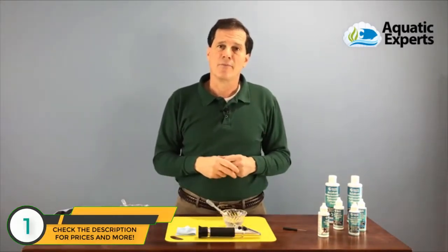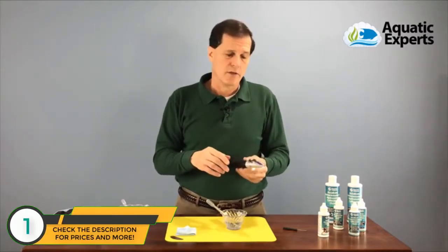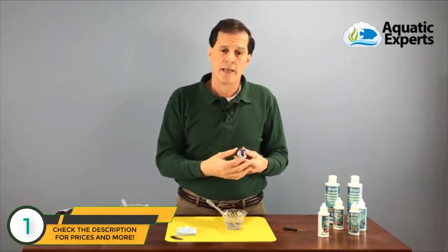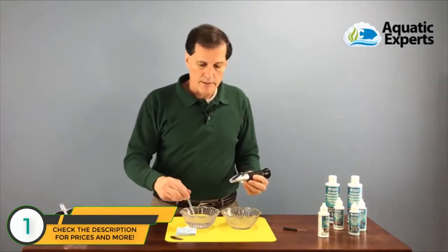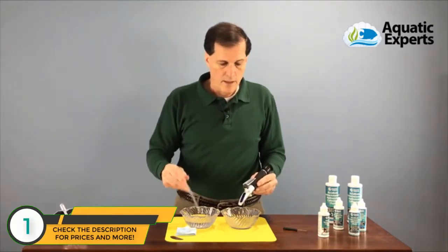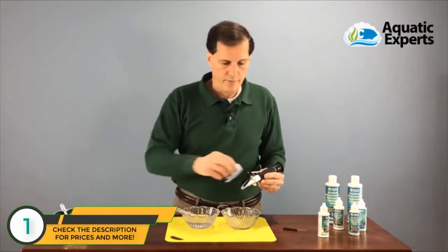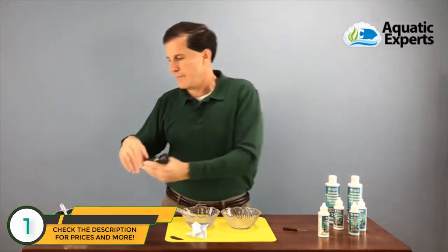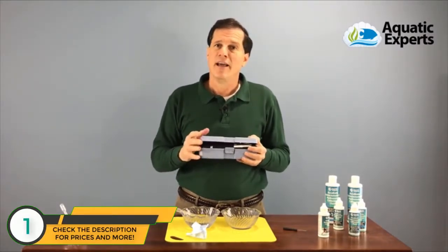I'll calibrate this every so often. You may have noticed I forgot to set my refractometer down for one to three minutes when testing the aquarium sample to equalize temperature — please make sure you do that. I was in a bit of a hurry, so it may not have been as accurate. Do set it down and let it rest for a few minutes. At this point, I'm ready to clean off my refractometer thoroughly, dry it off, and store it safely in its storage case since it is scientific equipment.